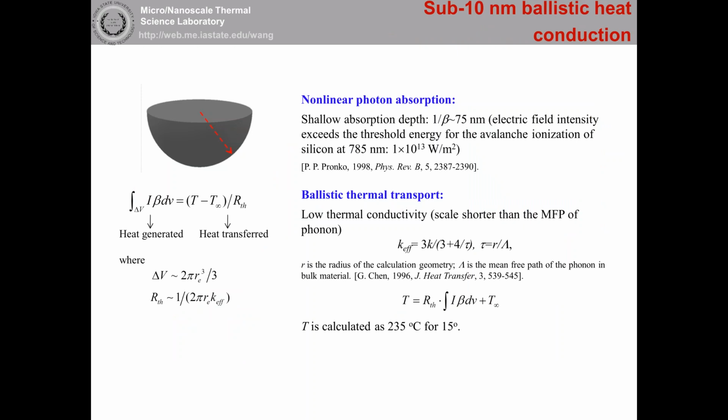This work was conducted by two students. One did the experiment, the other did the simulation. They were completely separate from each other. We wanted to make sure it was blinded, and then compare the results.